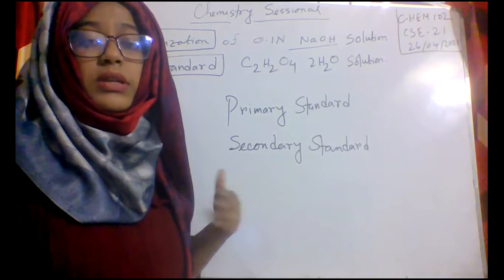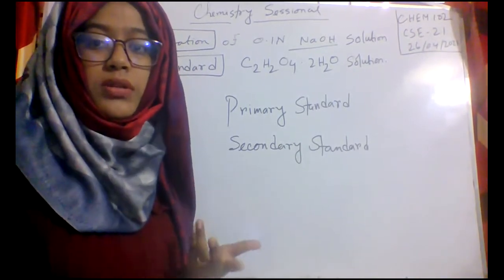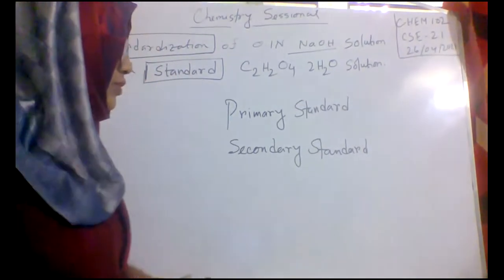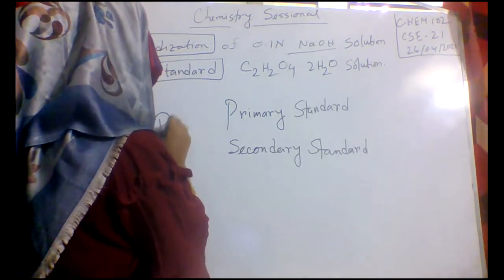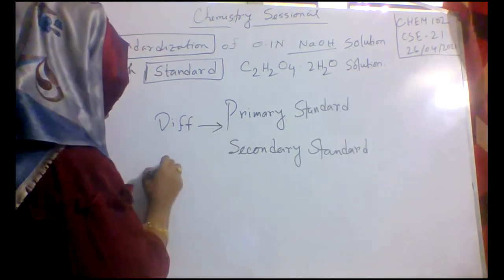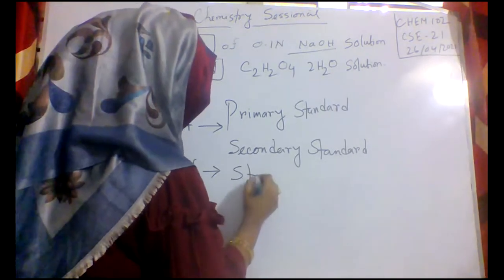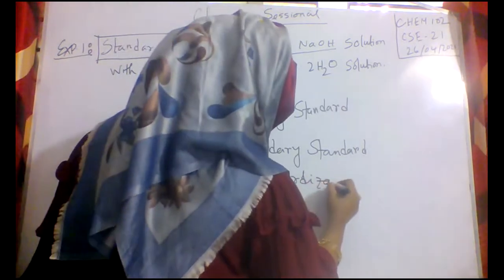So it's not only a titrametric process. It's a standardization based on titrametric process. You also have to know the difference between standardization and titration.